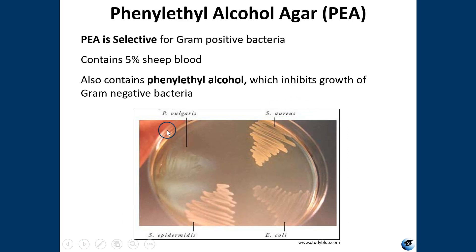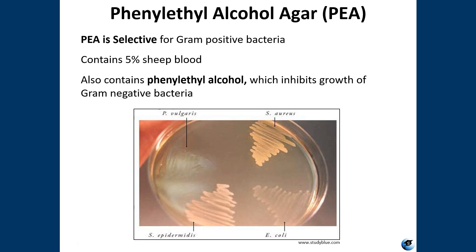In this figure you have Proteus vulgaris, Staph aureus, E. coli, and Staph epidermidis. Proteus vulgaris is a gram-negative bacterium. E. coli is gram-negative as well, and you can see it is actually growing on this media but not in great abundance — it looks like it's struggling, which is how it should look on PEA. Whereas both of your Staphylococci species, the gram-positive species, are thriving. They look great and are not having any trouble. So those are your three selective media.